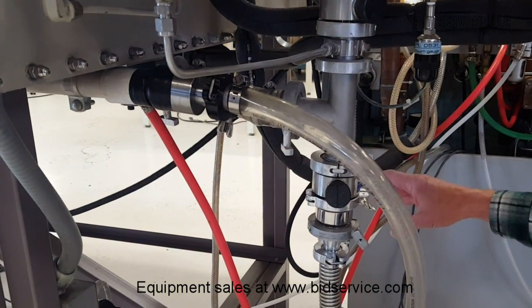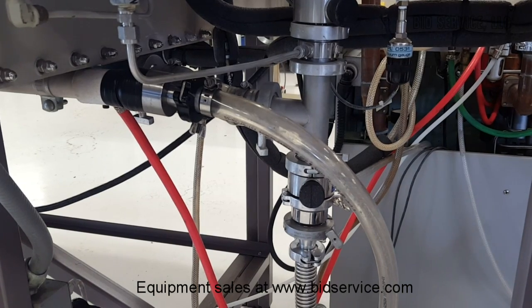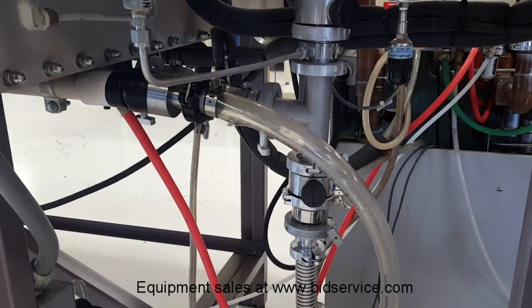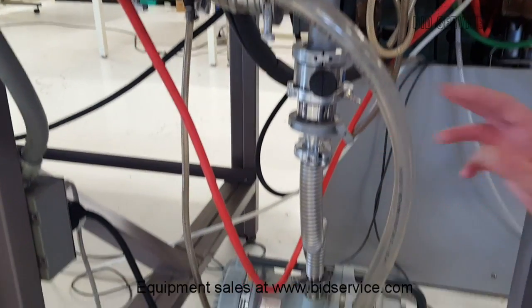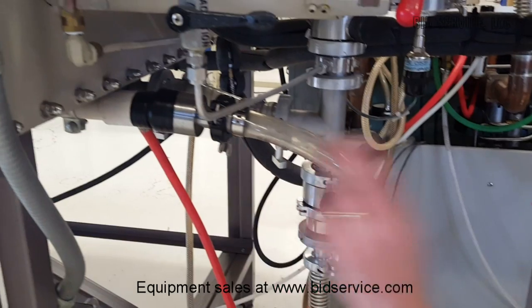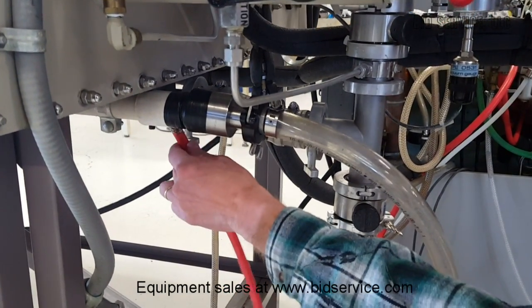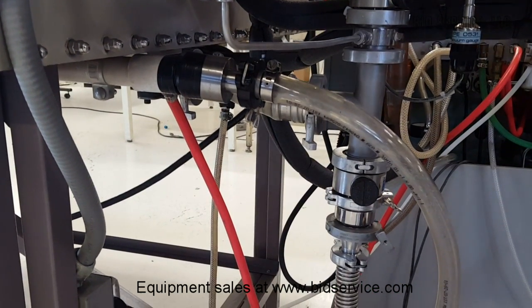There's also a vacuum port for regeneration — it'll pull back in through this line, as part of the regeneration cycle involves evacuating your purifier. Once the regen gas is purged, that's all explained in the manual you'll receive. Finally, we have an exhaust port that comes out of the vacuum pump and goes through this one-inch PVC pipe to the other side. During regeneration, the system will also exhaust out into the exhaust line.